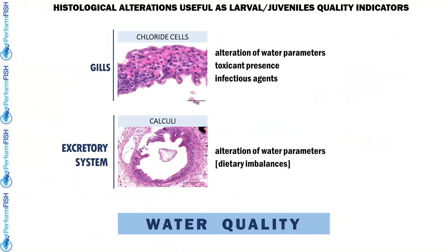What we derived may seem simplistic, because this scoring system tells us that the medium in which fish live and their diet are crucial determinants of well-being, and both are managed by humans. Yes, because the water quality definitely causes some histological lesions, causing OCV to exceed the threshold value.